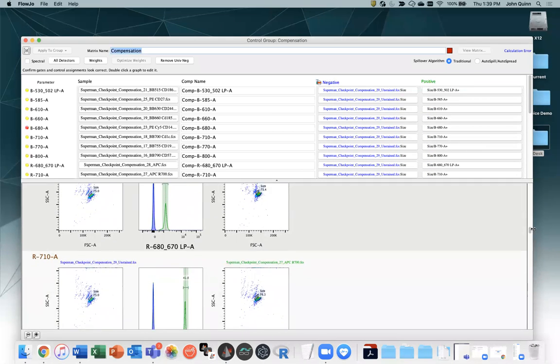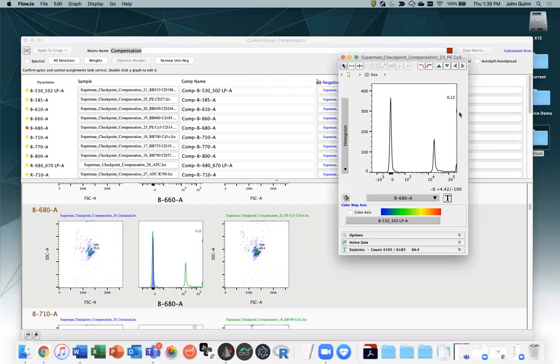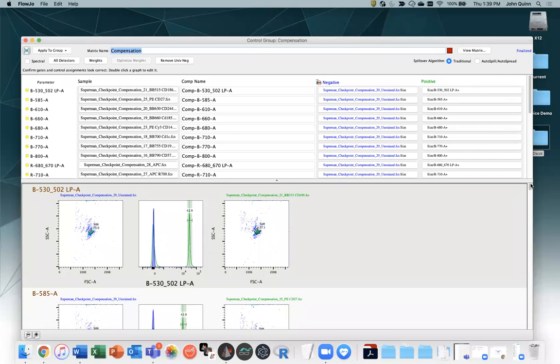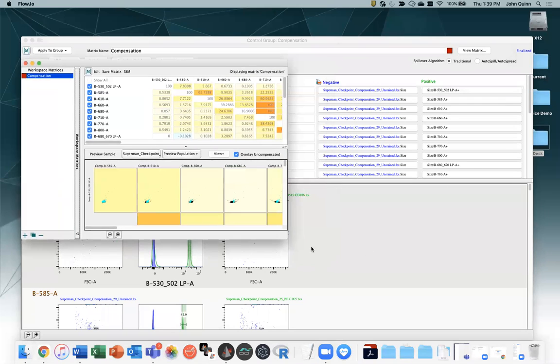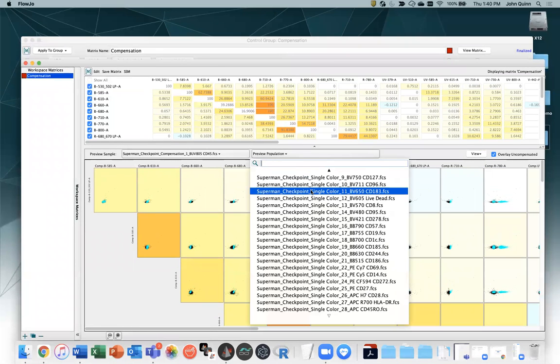And so, all right, we'll first do this with just pure Spectral, and then we will take a chance on doing AutoSpill. And we'd like that over here and not the stuff off scale. All right, I think that's okay. So to do Spectral, all you do is check the box here, Spectral. And so what this is going to do is now effectively very similar compensation, except that we'll create a rectangular matrix because we will, again, have more detectors than we have colors, and we can say view. All right, there is our spectral compensation matrix being previewed on one of the comp controls.